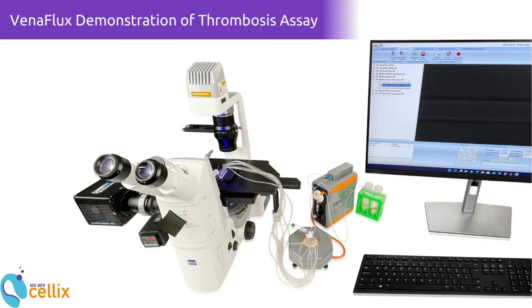This video will guide you through a detailed demonstration of Celex's Venaflux Starter and Pro products for the application of thrombosis.